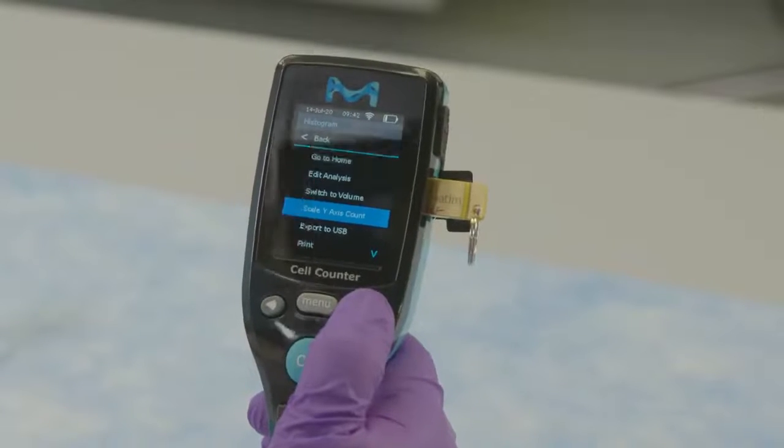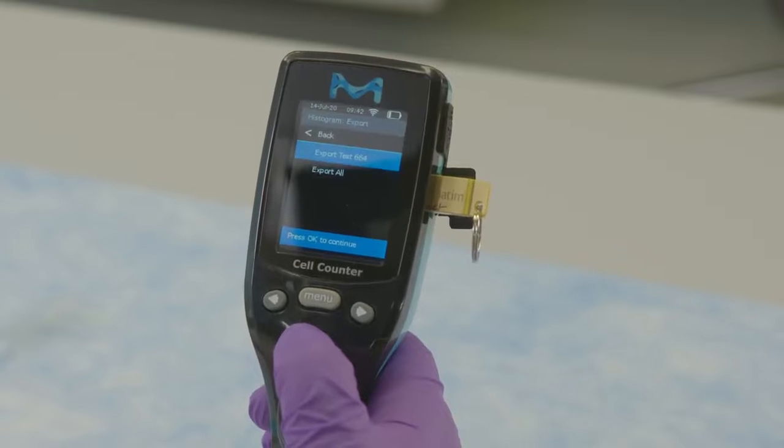From the main menu, exporting data, select one or export all and press OK.